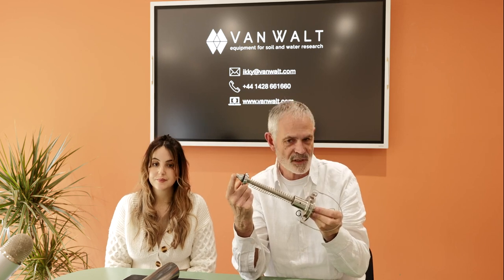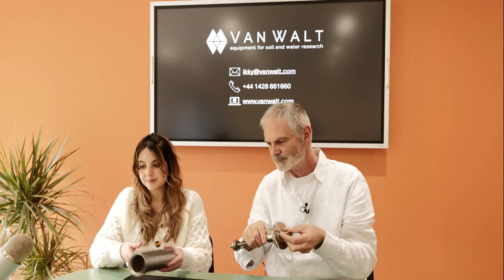Bottom part just unscrews. The top part similarly unscrews. And that's how it's constructed. And the reason I'm showing you it's not interesting from a technical or an engineering point of view. It's that when you have used a sample, you have got to clean it and decontaminate it because essentially it's a water sampler. So just take it apart, wash it, decontaminate it, and put it back together again.